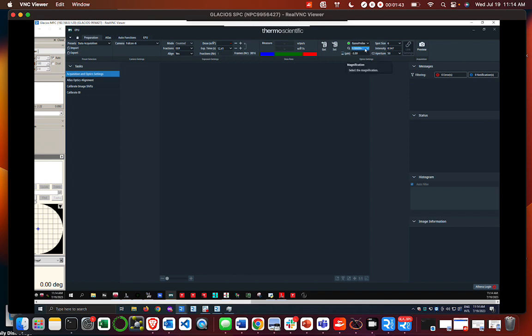For screening, we usually use 120,000 X mag, and we have a lot more options here. We have information about our dose, exposure time, and a little information about the optimal range for the dose rate, and an intensity and spot size associated with that.